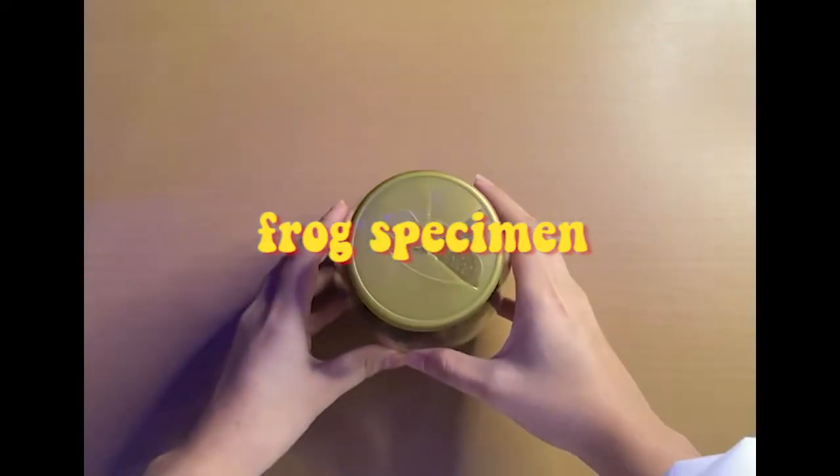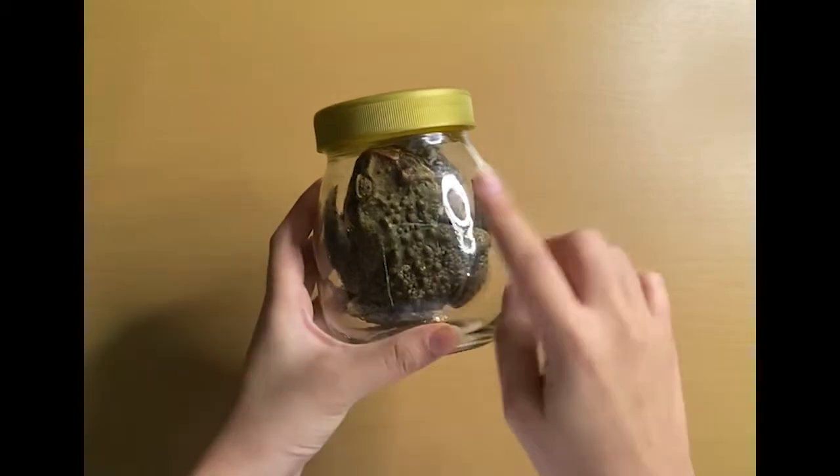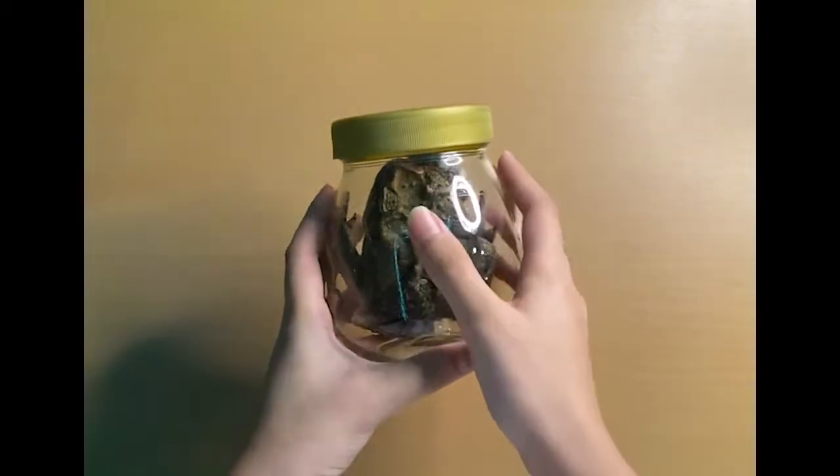And lastly, we need our frog specimen for today's experiment. He is quite large and I identified him as a male since he croaked a lot when we caught him by the community pool.